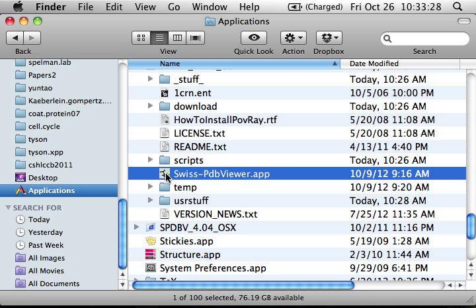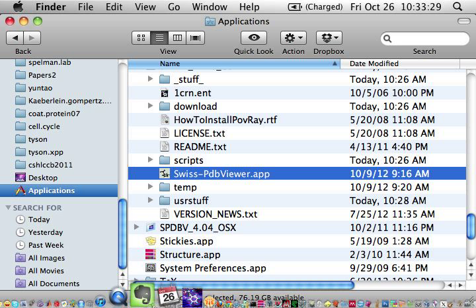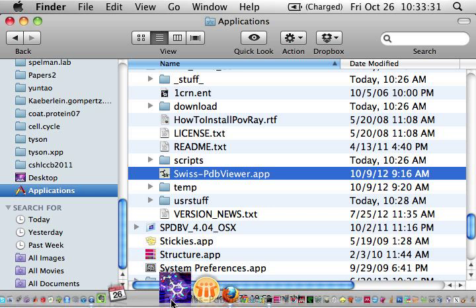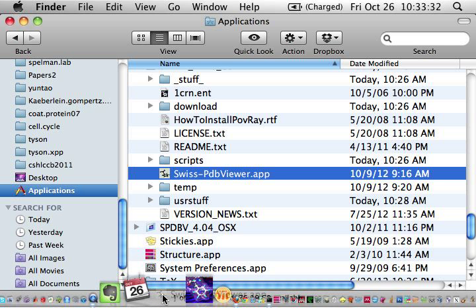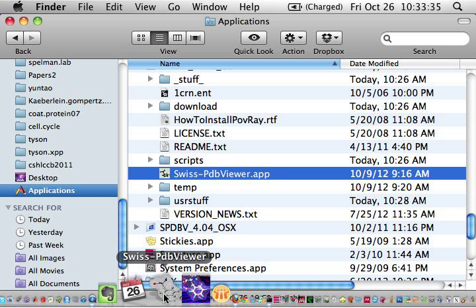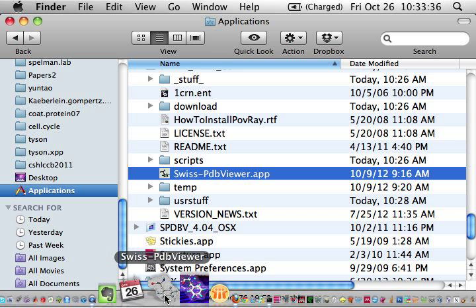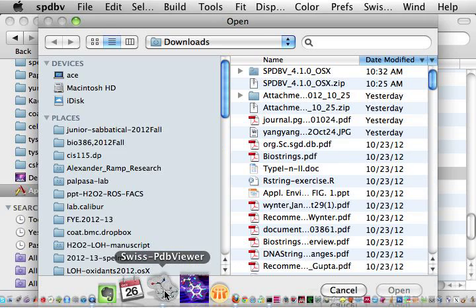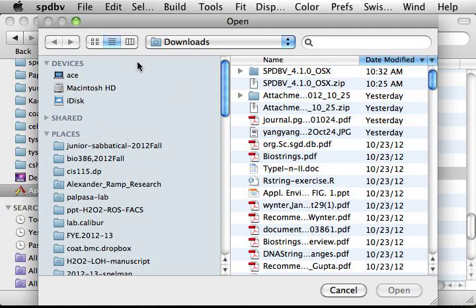So, and you can also drag it into your dock or something. And then you can use it and double click that. And that's a SwissPDBViewer.